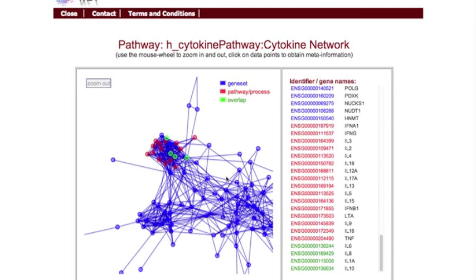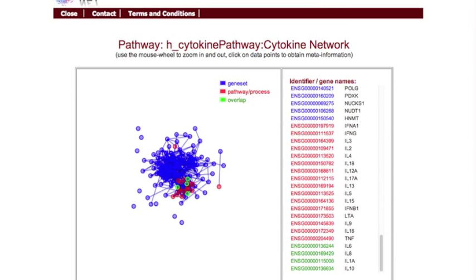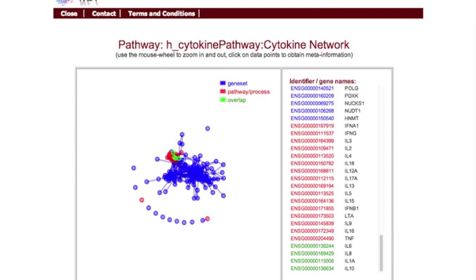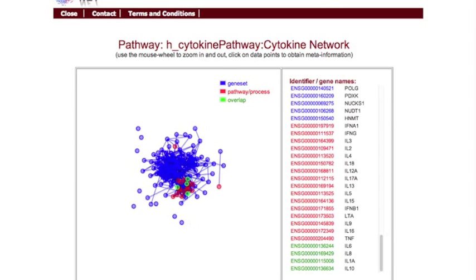At the bottom of the page, you can reset the plot, try out different graph layouts and download the network.